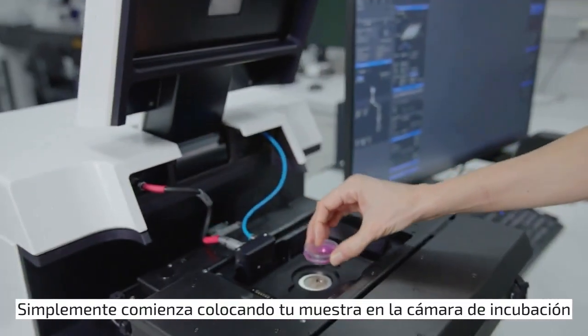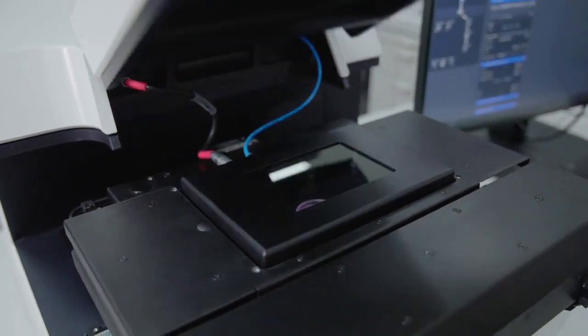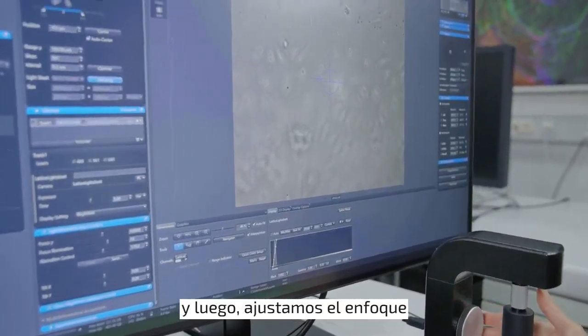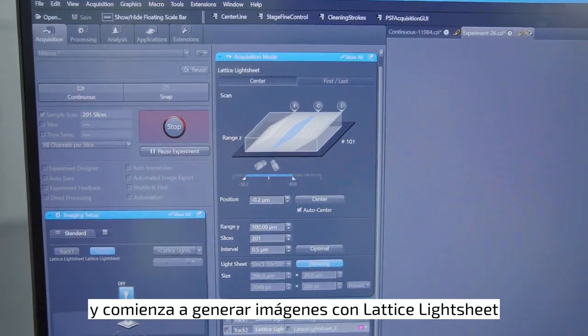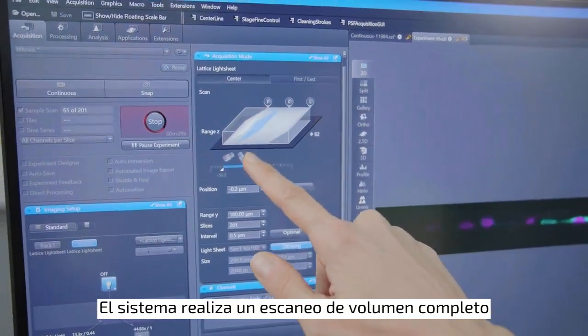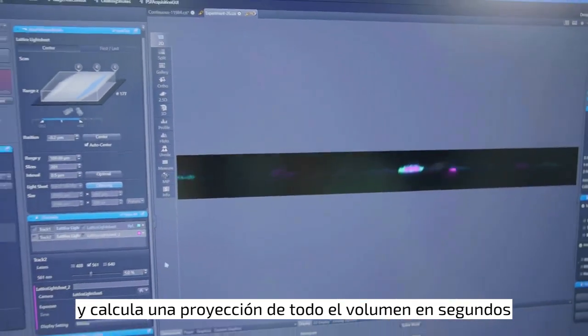It simply starts with placing your sample in the incubation chamber. We first locate the sample in brightfield mode and then we adjust the focus. In the next step, we switch to fluorescence mode and start lattice light sheet imaging. The system performs a full volume scan and calculates a projection of the entire volume within seconds.